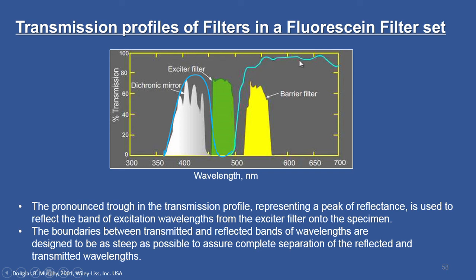It goes almost 90%, which separates the excitation radiation from the transmitted radiation. So, this is a very high performance filter.